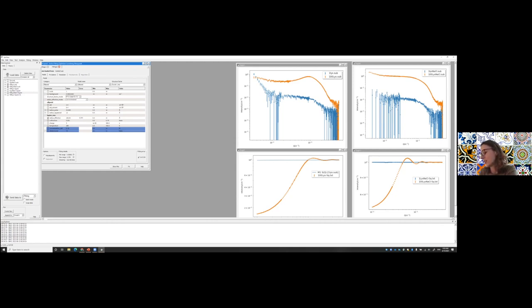In the suggested discussion, I ask you, why didn't we choose a hard sphere factor for the zero molar sodium chloride case, since the structure factor is not made for very dilute solutions? And that is why, because we expect some charges in it. So we know the protein, we know the PI of the protein, so that's something you will know from before your experiment. You will know the PI of your protein.